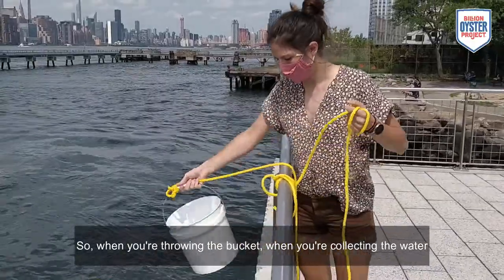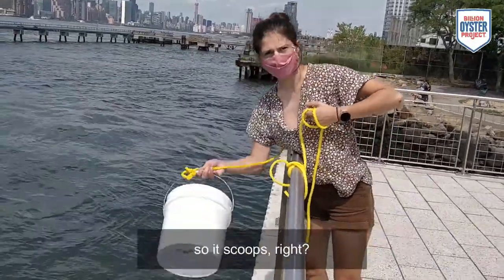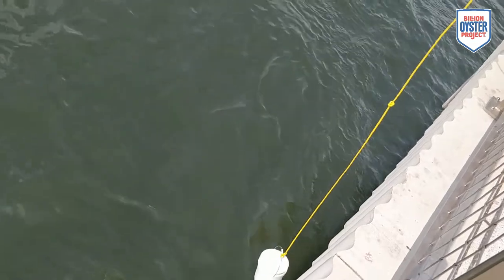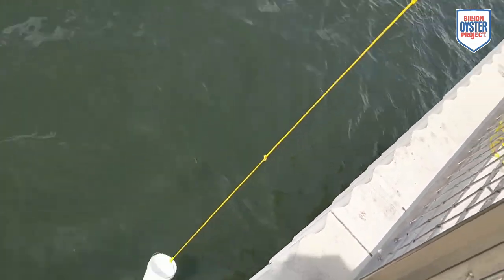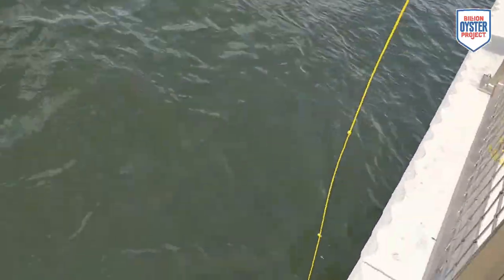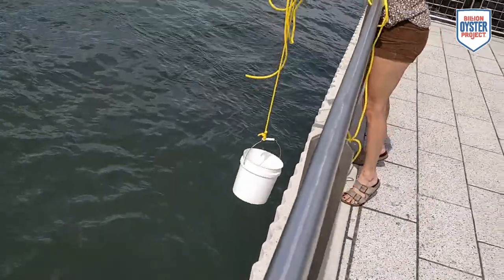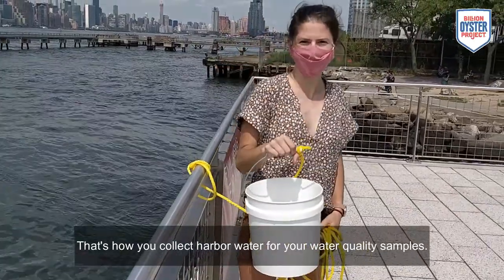When you're throwing the bucket and collecting the water, don't just throw it down. You have to get it at an angle so it scoops. I'm going to lower it and go at an angle. That's how you collect harbor water for your water quality samples.